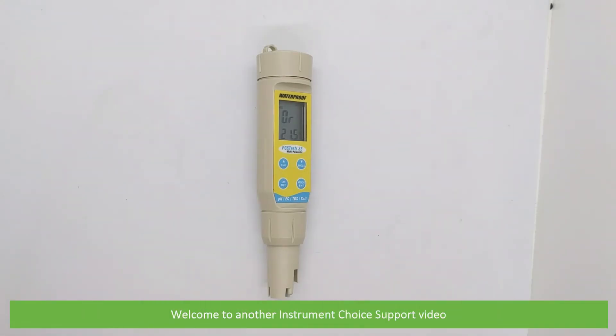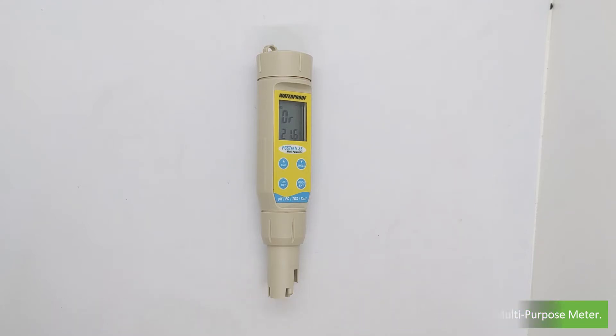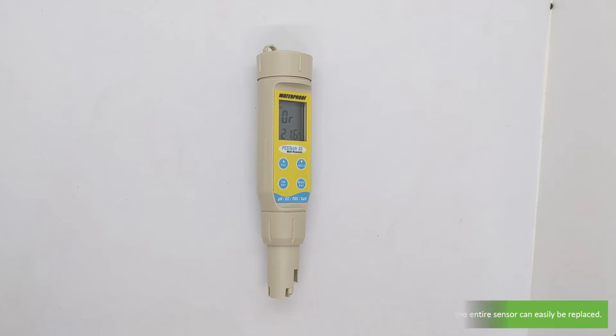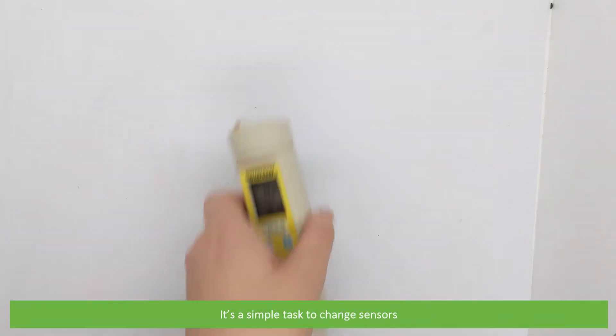Hi and welcome to another Instrument Choice support video. In this video we'll demonstrate how to change the sensor on the EC PCS Tester 35 waterproof multi-purpose meter. The EC PCS Tester 35 features a replaceable sensor. If the sensor tip becomes damaged or the sensor wears over time, the entire sensor can be easily replaced, saving you from replacing the whole meter. It's a simple task to change sensors.